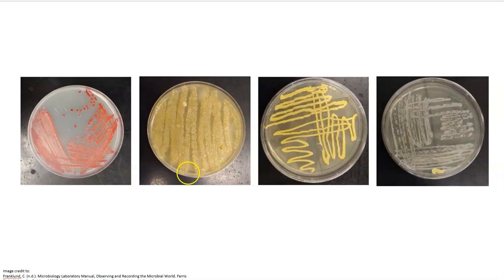So typically, like I said, you do streak 1, and then you sterilize your loop to get the extra bacteria off. And then you pull a little bit from quadrant 1 into quadrant 2, and then again you sterilize your loop and then pull from 2 to 3, and then again you sterilize your loop and pull from 3 to 4. What looks like possibly happened here is that the loop was not sterilized in between to get the extra bacteria off. So they did quadrant 1 and then just immediately pulled 1 to 2, 2 to 3, and then 3 to 4. And if you don't get the extra bacteria off, all you're really doing is stirring your sample around. You're really not diluting it like you're supposed to be.